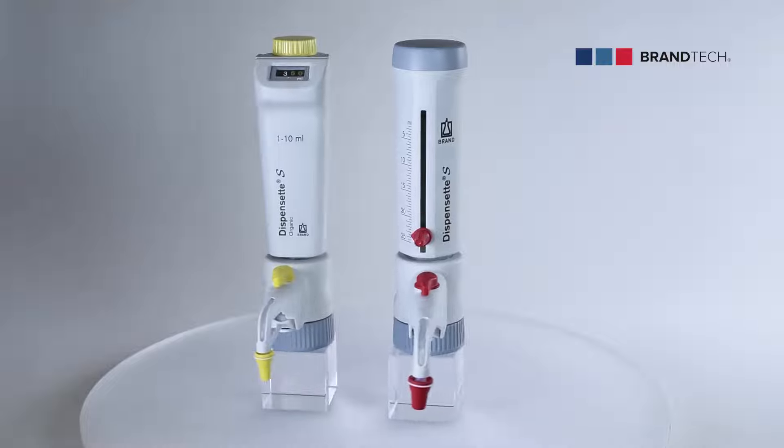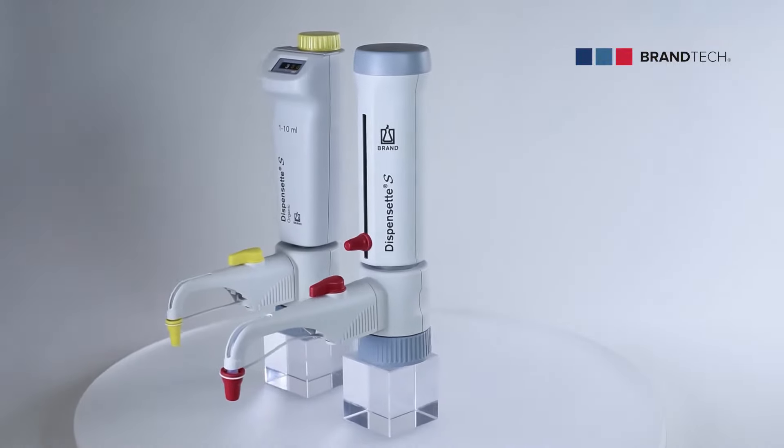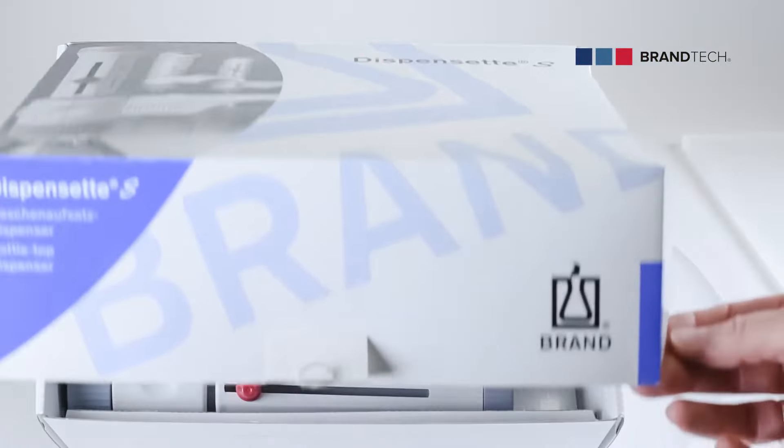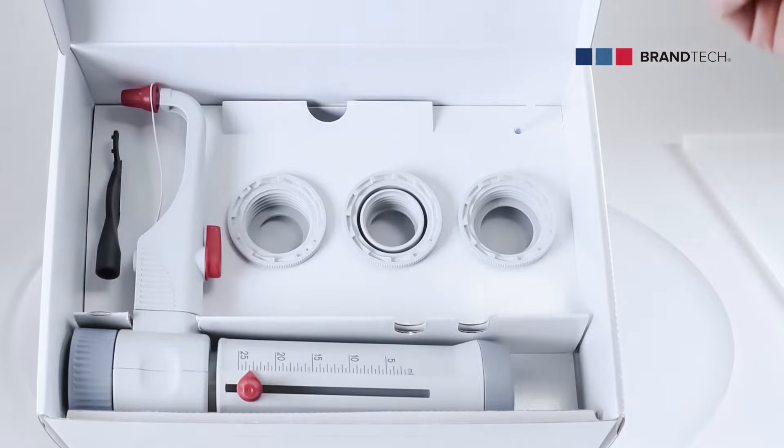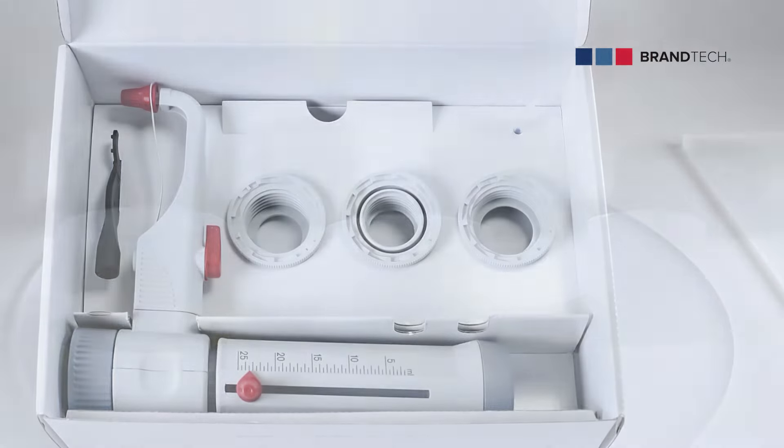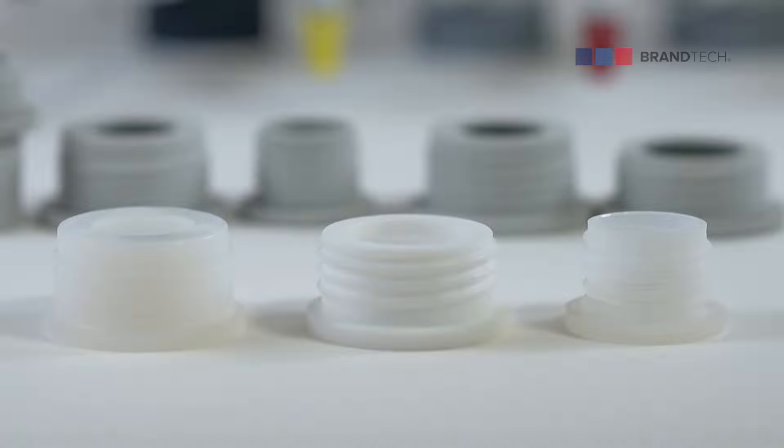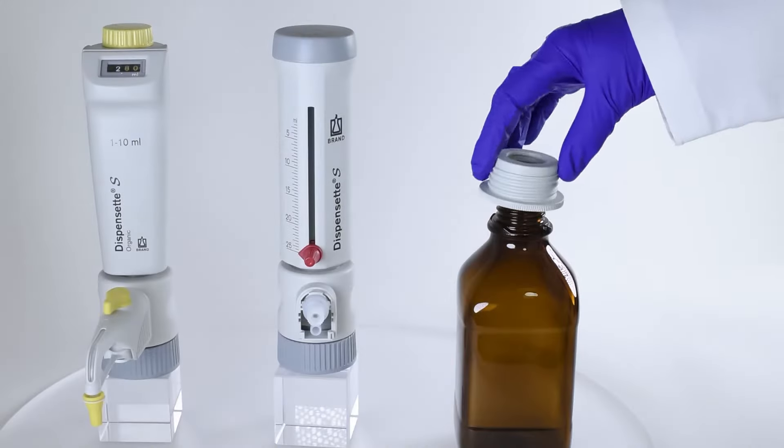The Dispenset S and Dispenset S Organic both have 45mm threads. They are also supplied with a selection of thread adapters to fit most common laboratory bottles. Select the appropriate adapter and apply it to your bottle.